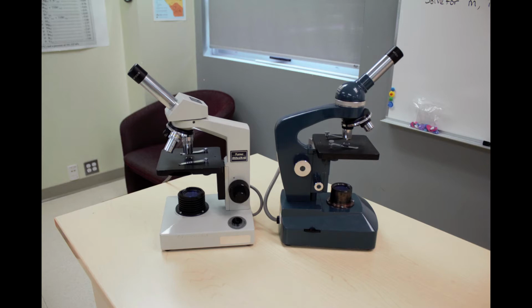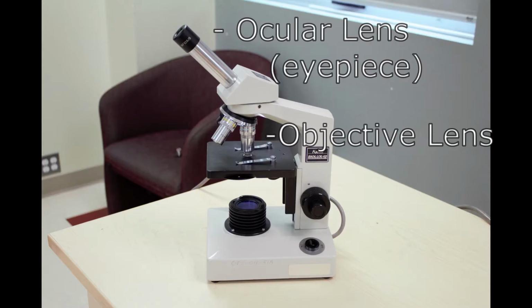Here we see a couple modern compound microscopes that we have in our lab. You can see the two lenses, the ocular lens or the eyepiece, and the objective lens. The eyepiece is the lens that you look through that focuses the light onto the back of your eye, or your retina. The objective lens is the lens that focuses the light shining through the object that we're interested in.